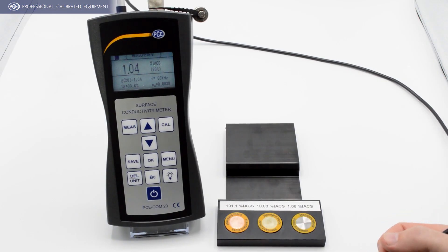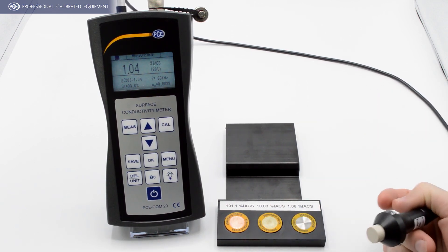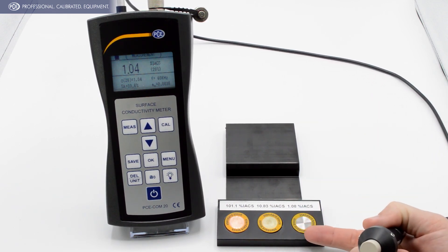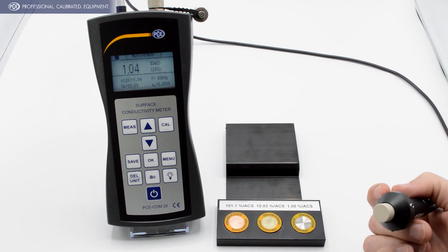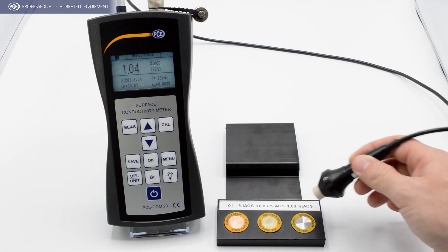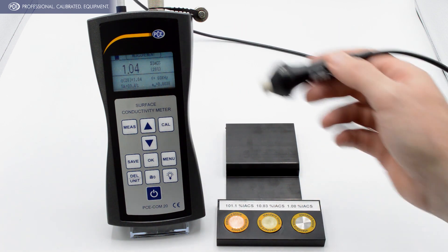So for this application video we're going to be looking at a piece of aluminum. This is the standard calibration block that comes with the meter. We've already done the two-point calibration procedure which is listed in the manual. So I'm going to show you on the calibration standards that it's pretty dialed in.